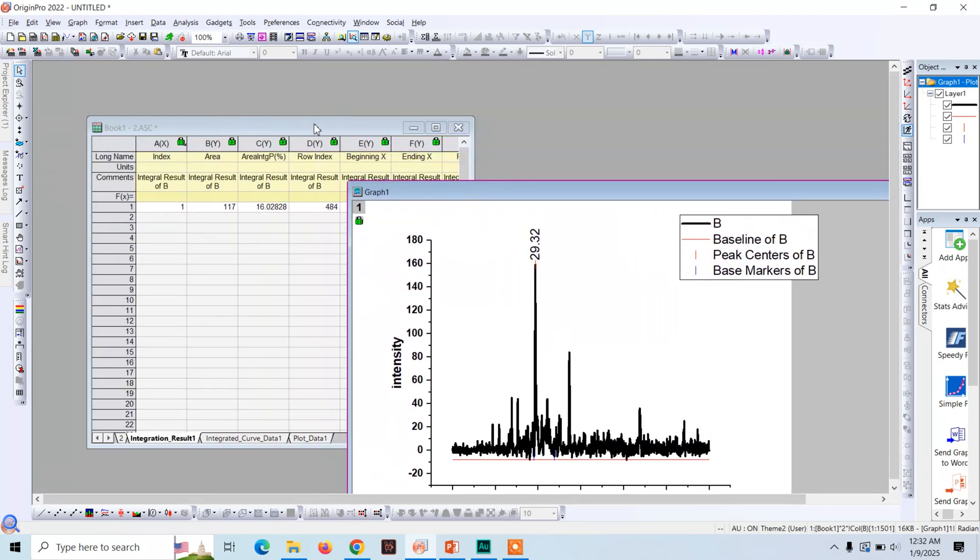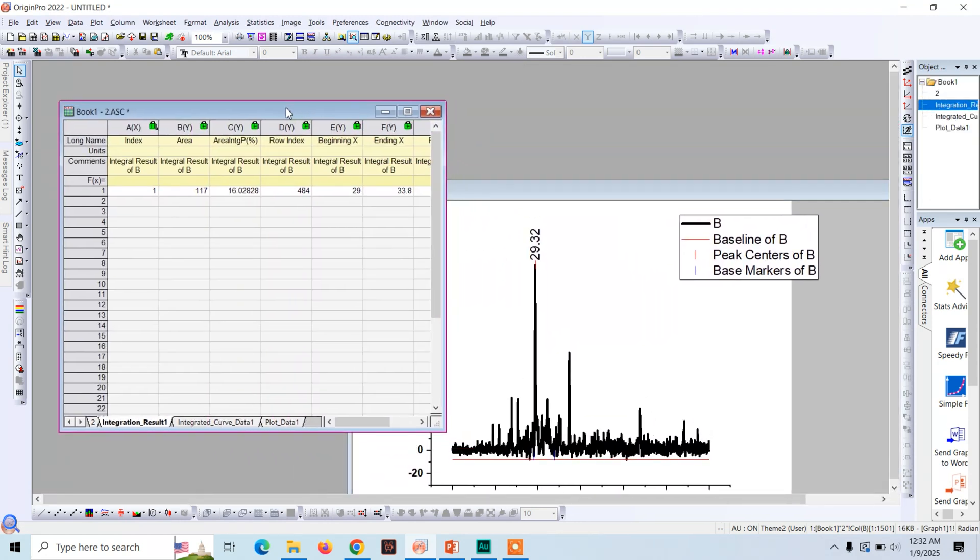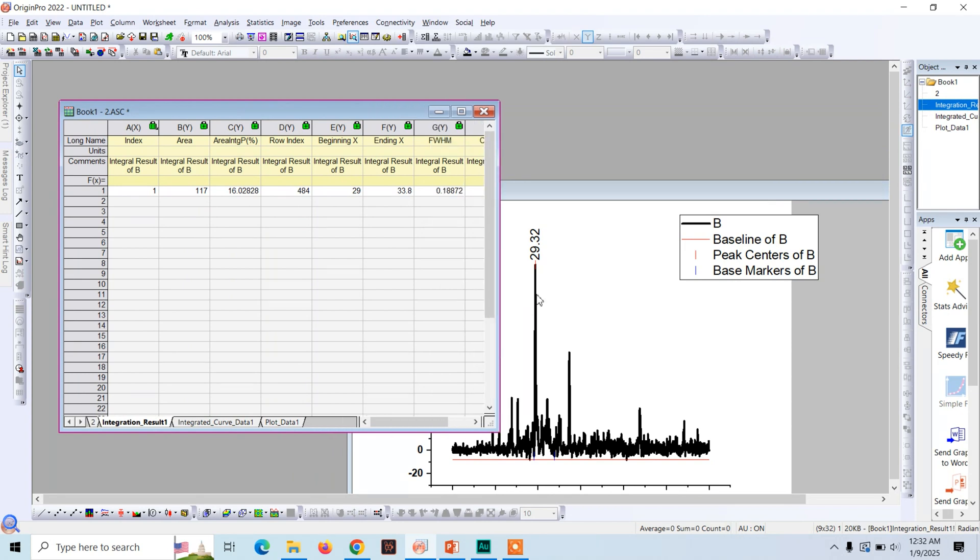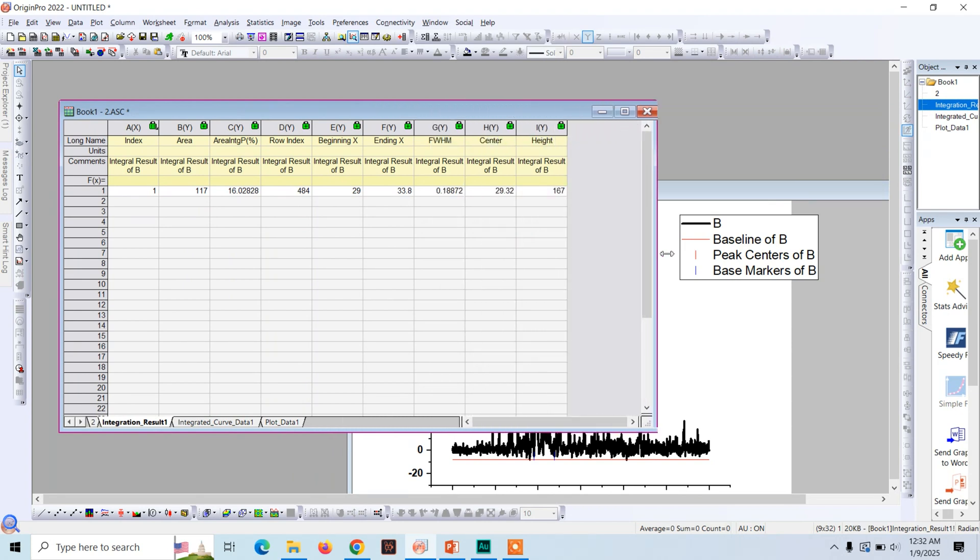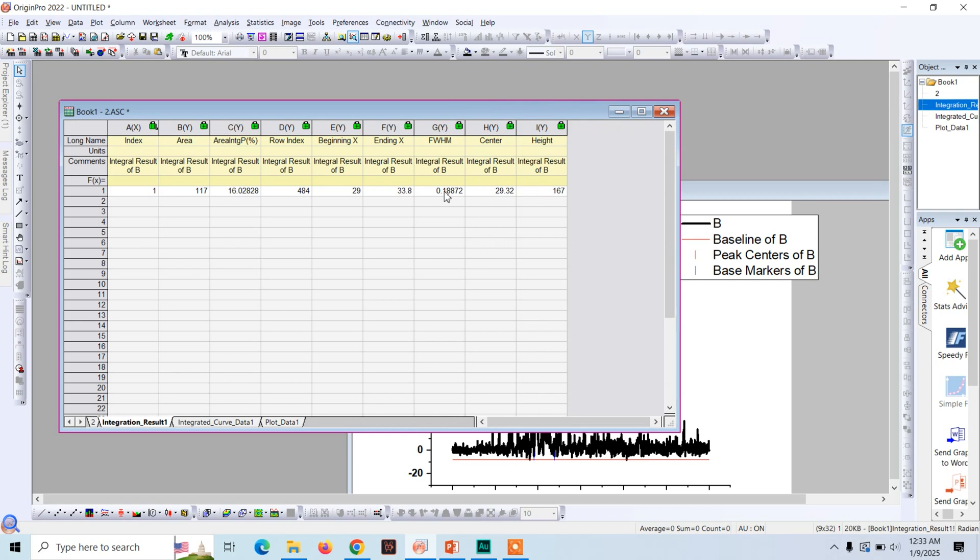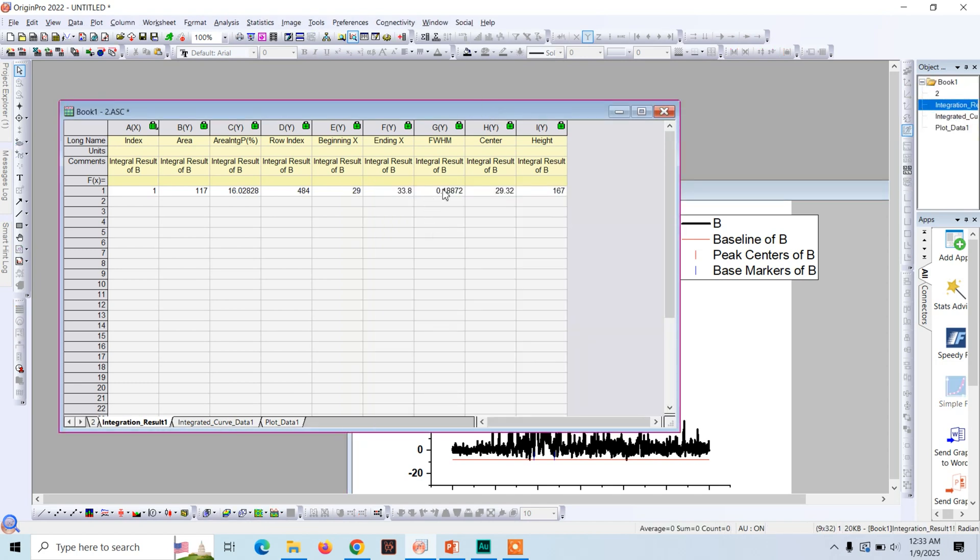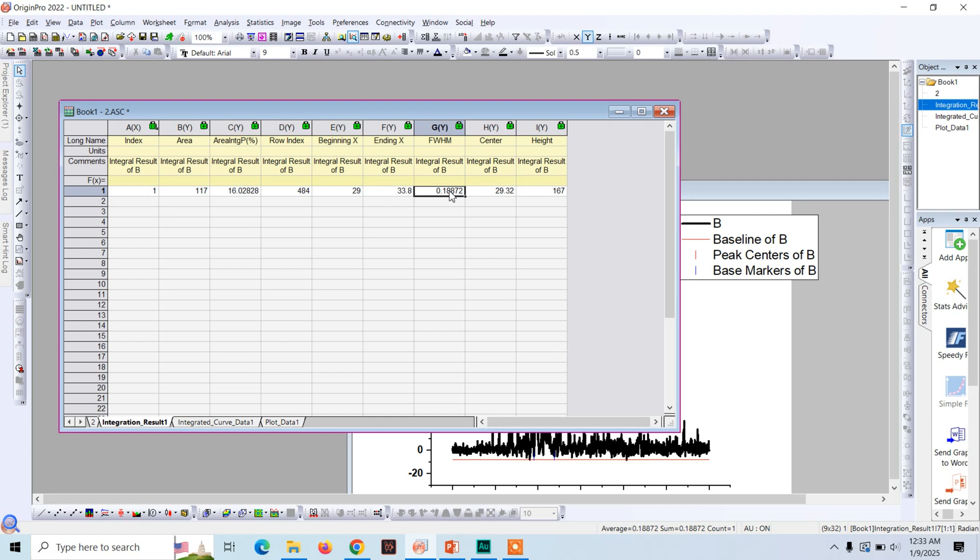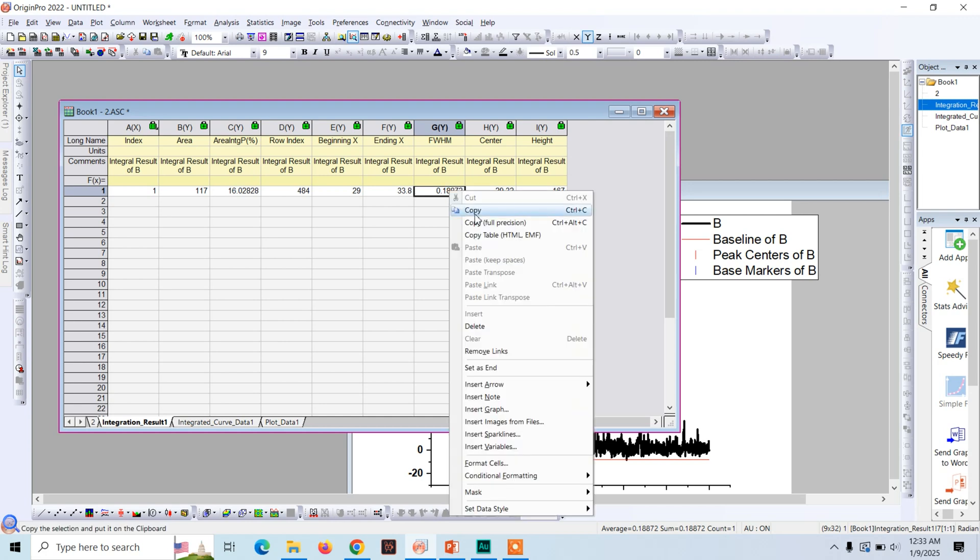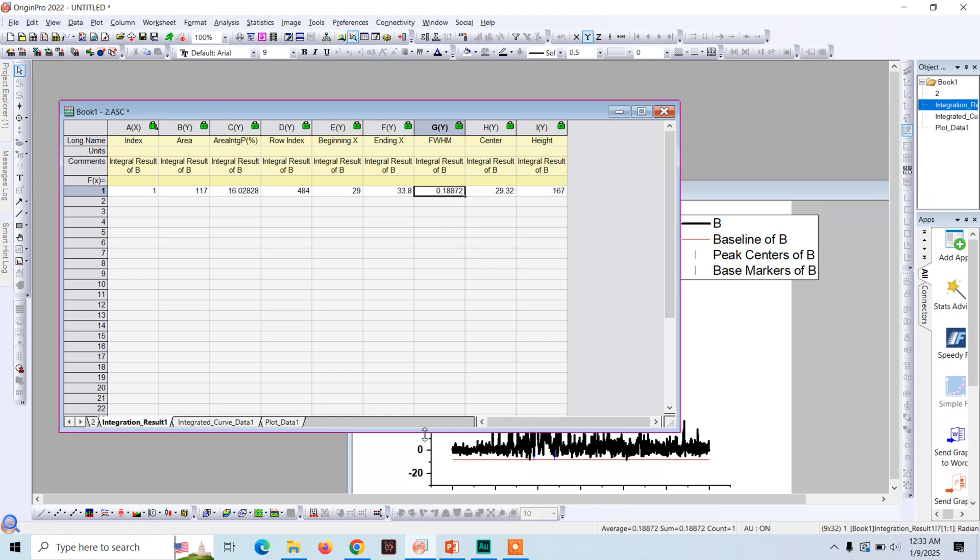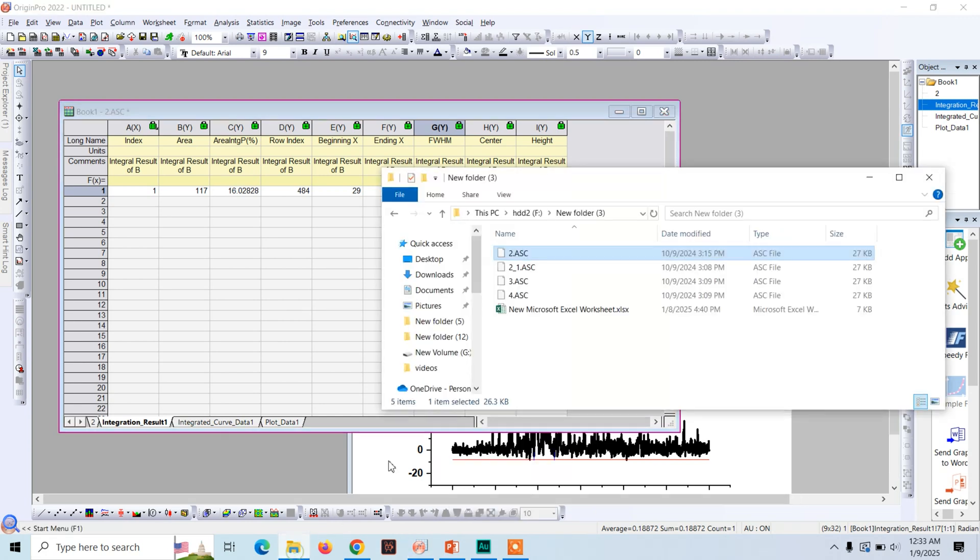And here you will see the option FWHM. Take this and click on Finish. So here is the data for this peak. The full width at half maximum of this peak is 0.18872. Now we will convert this to radians. Now let's calculate the crystal grain size. Copy this from here, open Excel sheet, and paste it here.